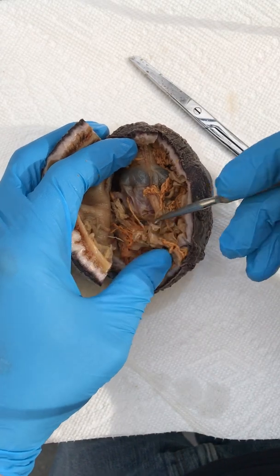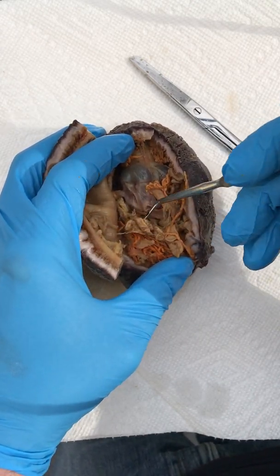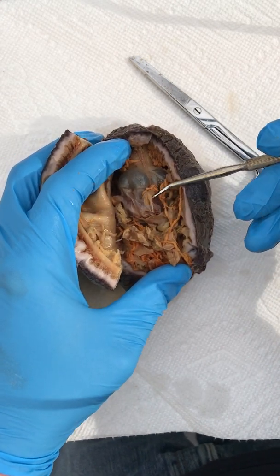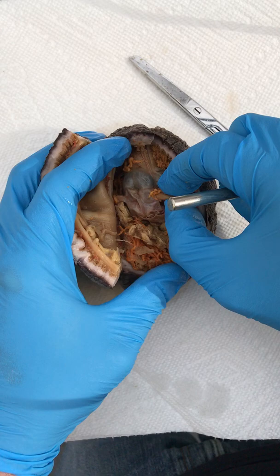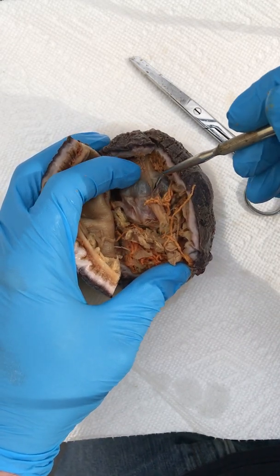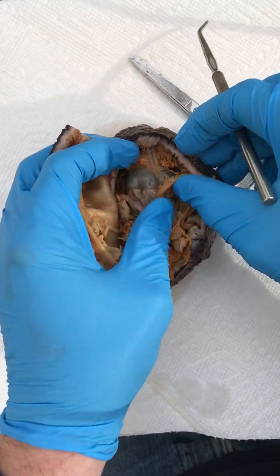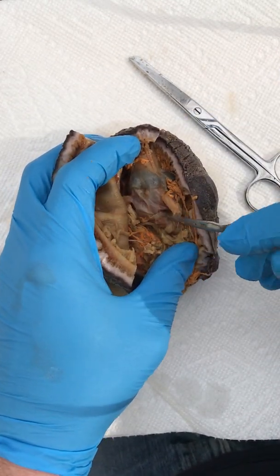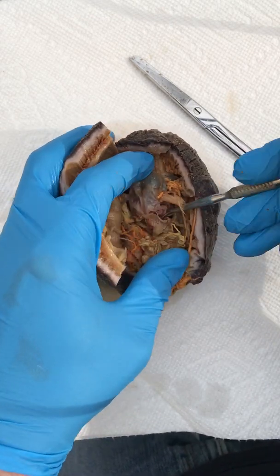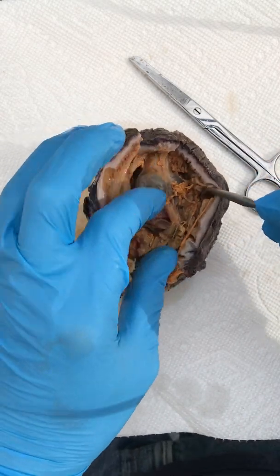You'll see this is the intestine wound around some of the gonad here — it has more of a yellowish off-white color. This muscle here, which I've actually sliced during the incision, is called the pharynx retractor muscle, and it's attached to the pharynx. This large bulb here is the pharynx, which leads down into the stomach. Below the pharynx, this reddish color is probably some partially digested food — and down here where I'm poking with the probe is the stomach.